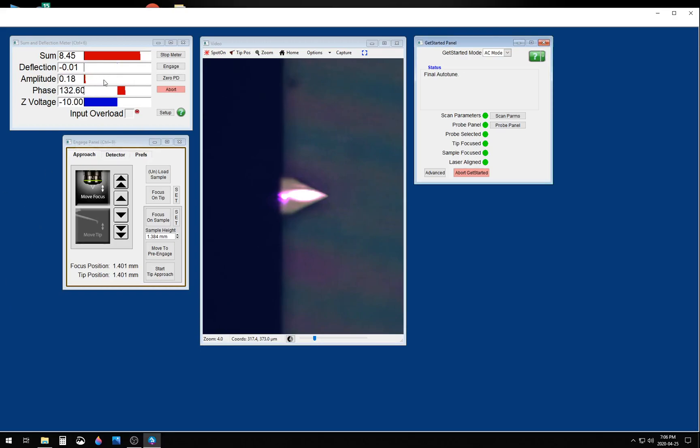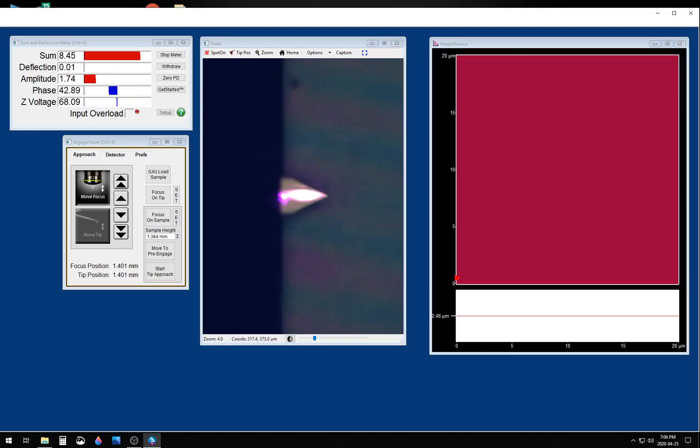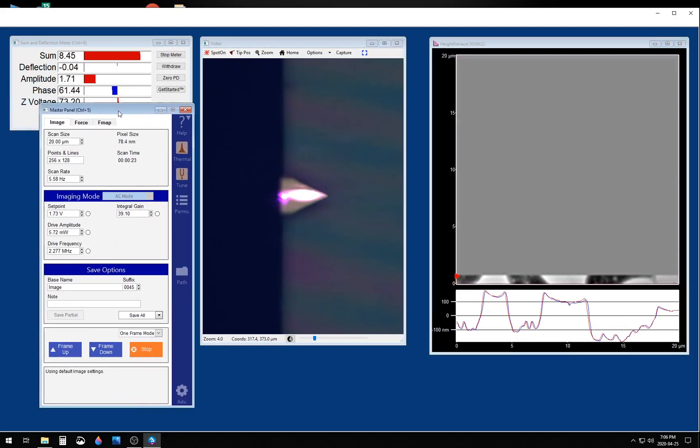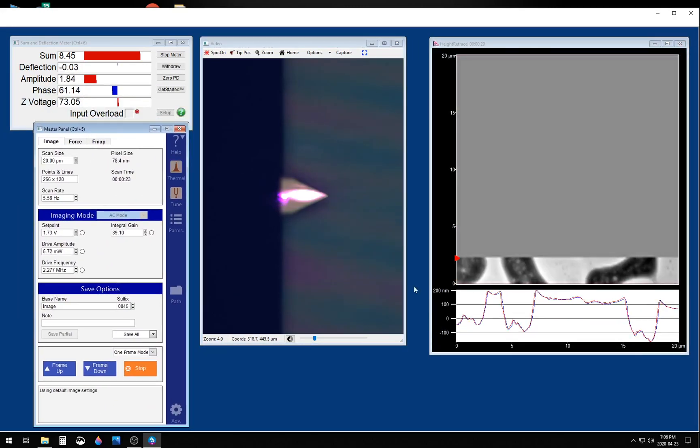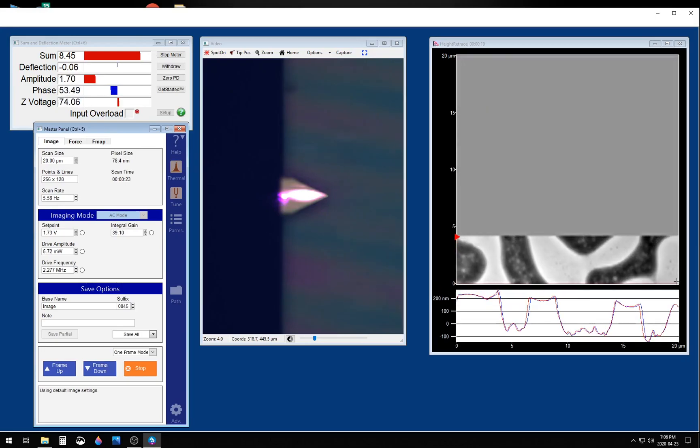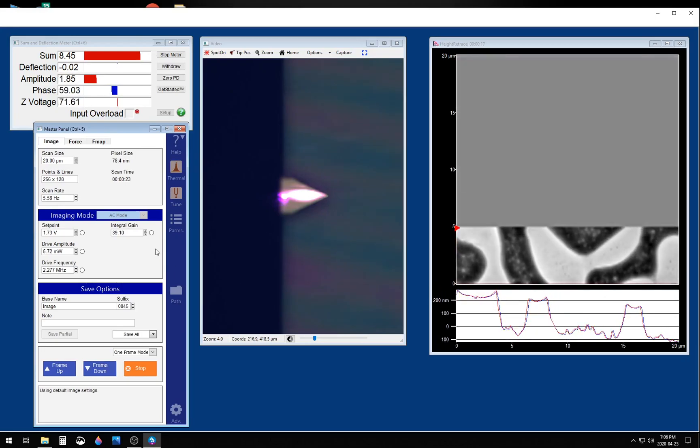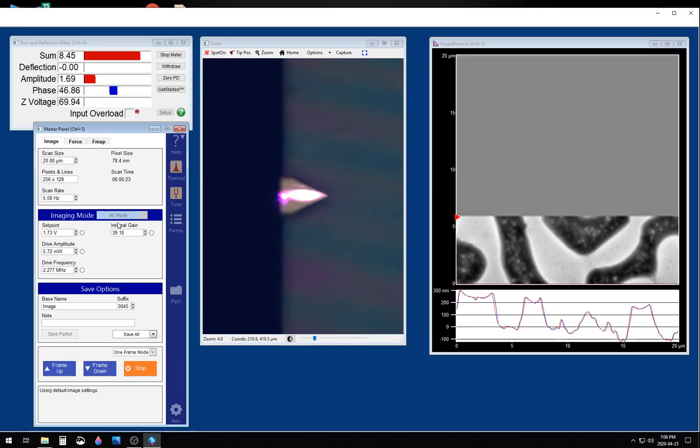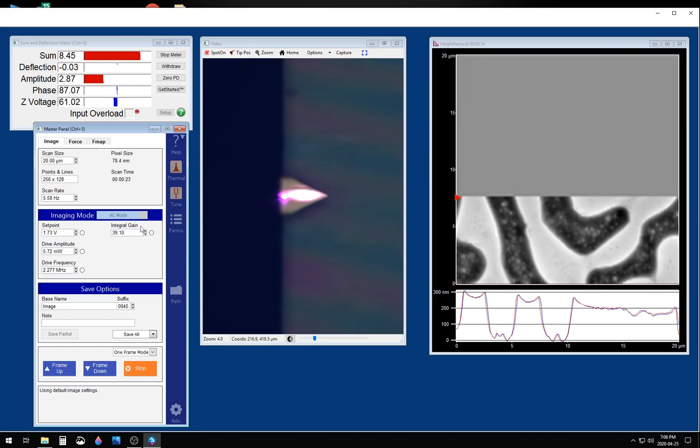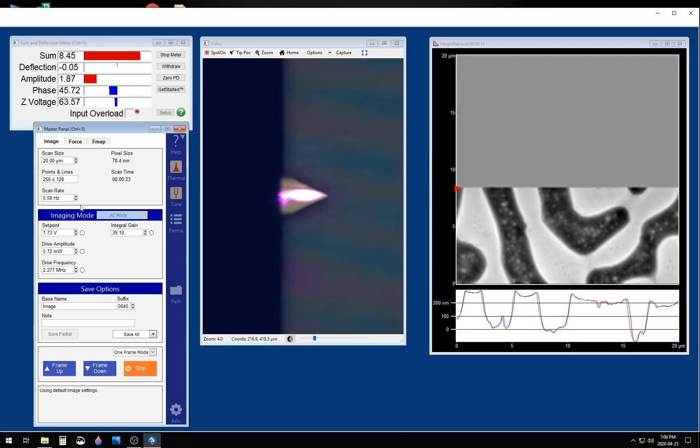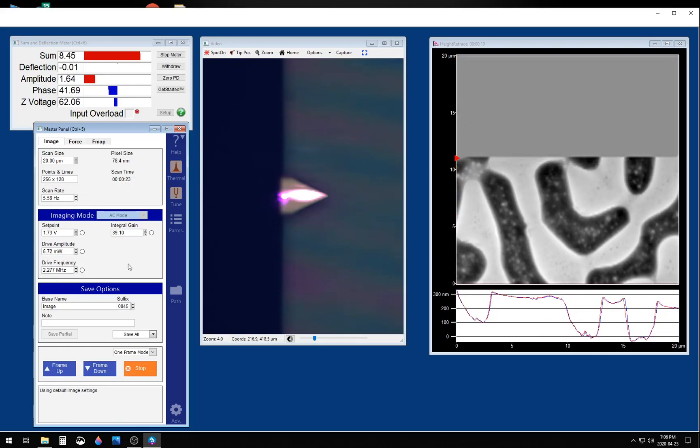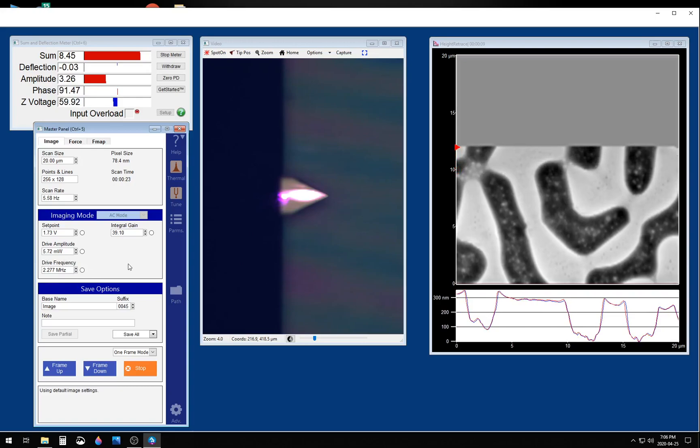After retuning the cantilever, it will simply start the scan. Note that once the tip lands on the surface, on the very first line, it is already tracking. It is able to figure out the imaging parameters, such as the scan rate, appropriate for this high-frequency cantilever.